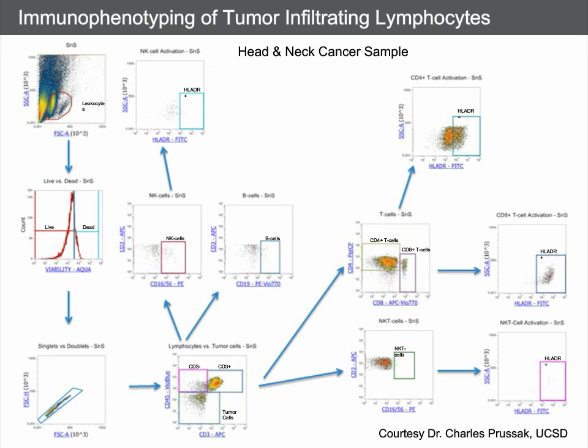And so in this case, we can look at not only our tumor cells, but infiltrating lymphocytes, and then subcategorize those into natural killer cells, B cells, subsets of T cells, and then look at the activation state of each of these subtypes of cells, where not only the presence of those cells is critical, but their activation state and additional details about those cells is important to decide what route to pursue and whether this patient is a good candidate for these therapies.